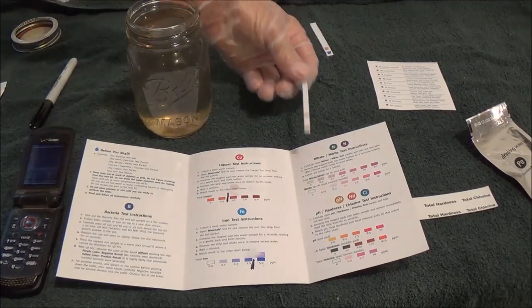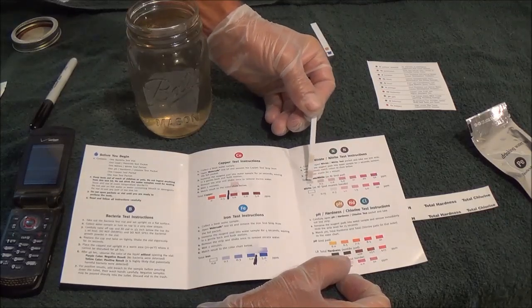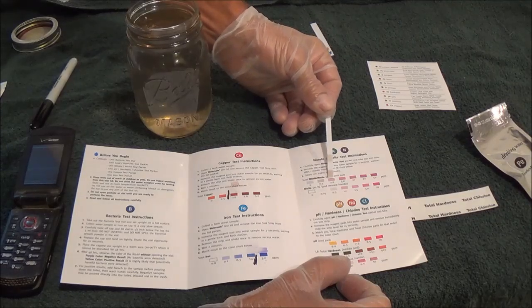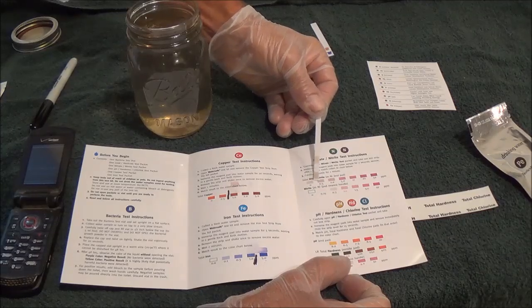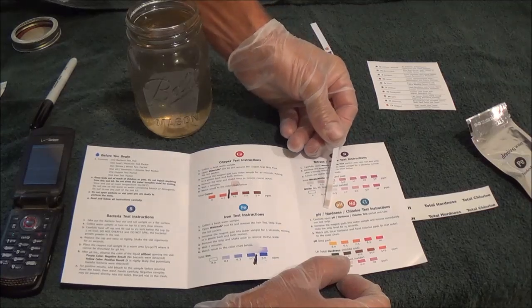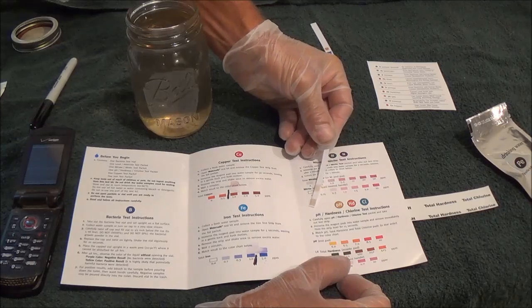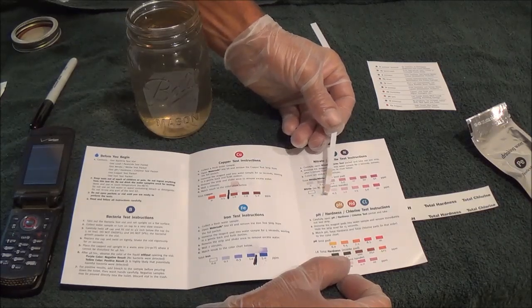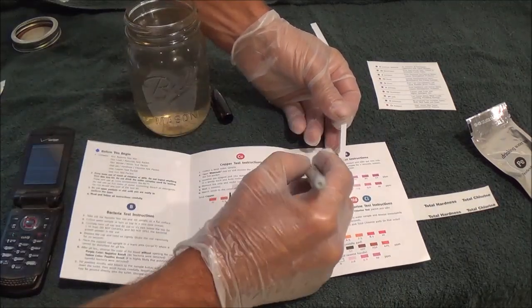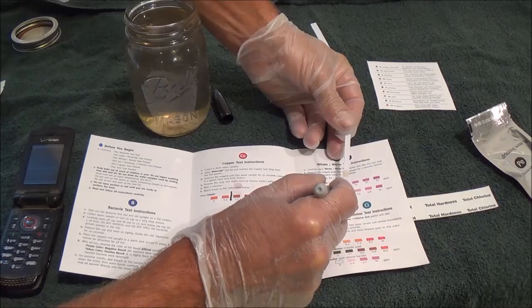Okay, one minute is up. So the top one, or the bottom one I'm sorry. It's maybe 0 to 0.5. And the bottom one, I'd say between 0 and 0.15 because it's not very dark. They're both really low, I guess we can say that. So this one's going to be here, and this one I'm going to say maybe right there.